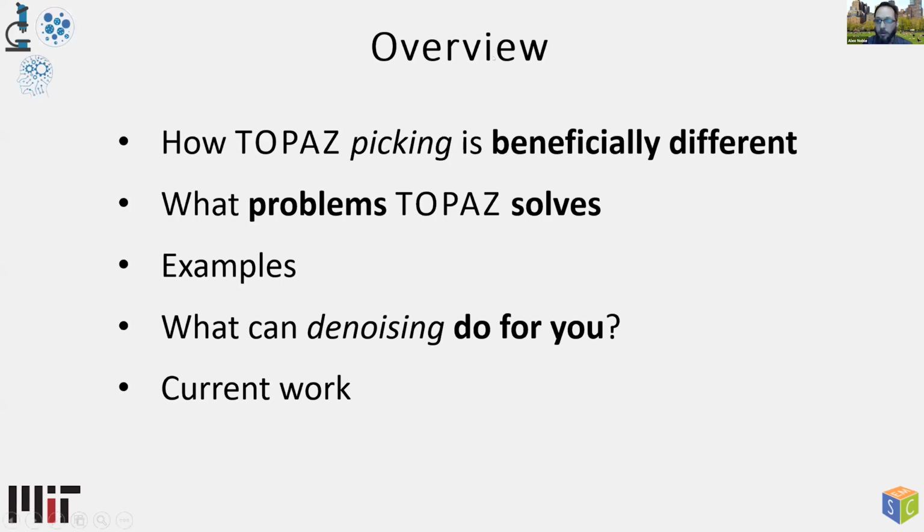So I want to open up my chat. I see I got 100 replies here. Quickly scroll through: 1, 1, 2, 3. All right, lots of 1s, lots of aggregation problems, a good amount of 3s, small particles. Okay, so hopefully this talk is actually useful for you because all this software is available and actually integrated. I'll show you that later.